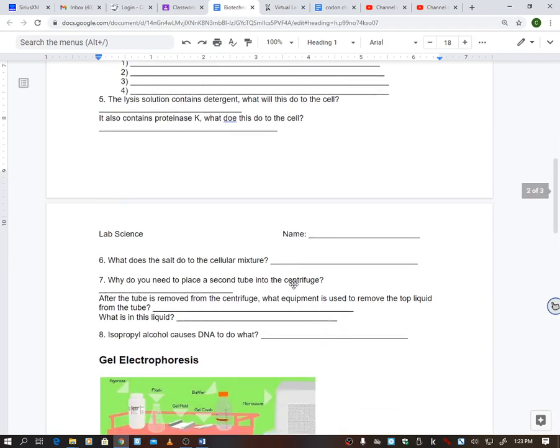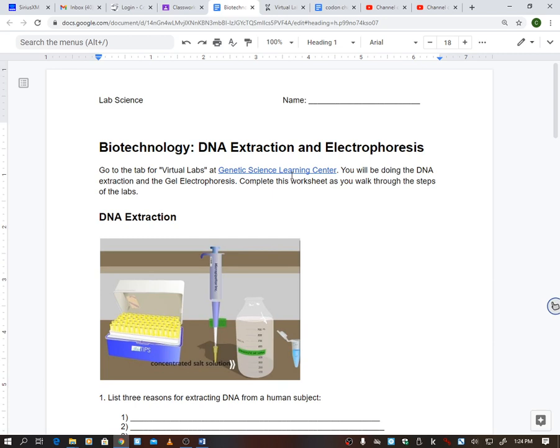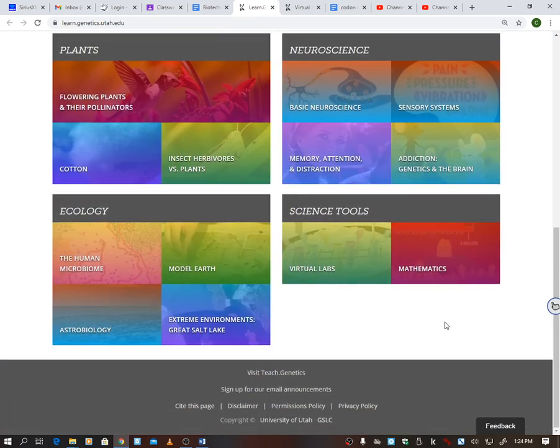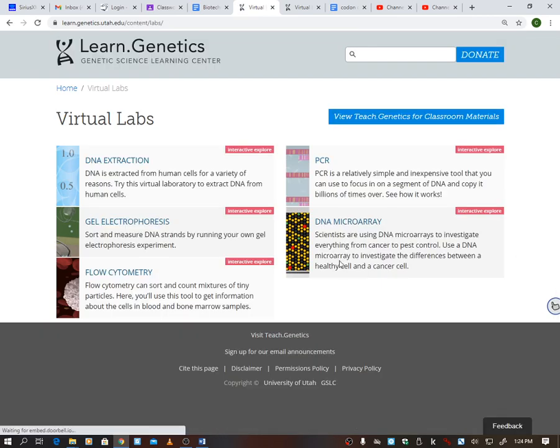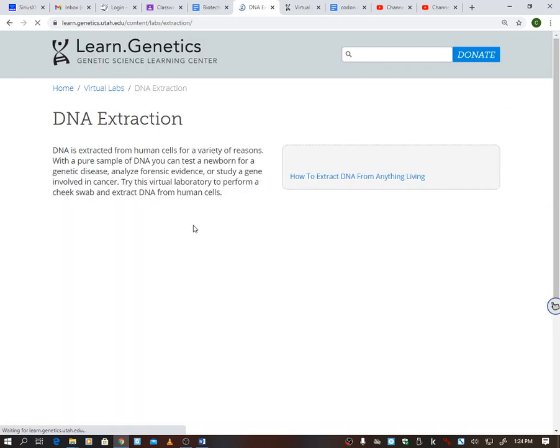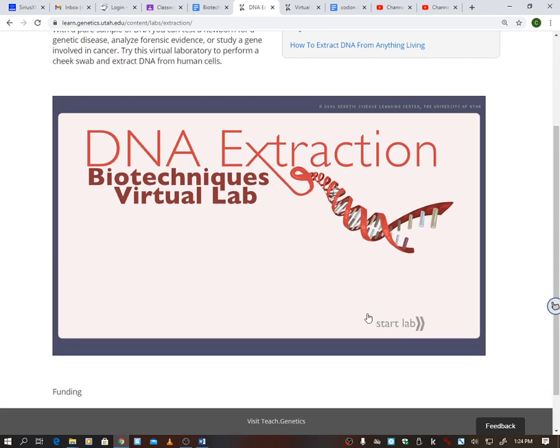So you have this worksheet that you're going to complete and fill out. That third sheet is just nothing. But you're going to start with going to this website. Now when you go to this website, you are going to scroll down all the way to virtual labs. So if I look back here, I'm going to do DNA extraction first. So I'm going to click on the DNA extraction, and then you can start the lab.